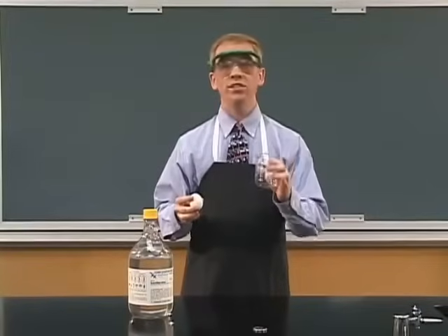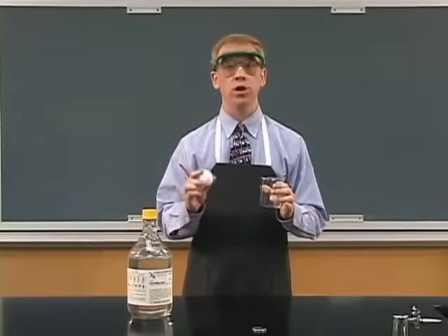Now, I'm going to show you the right way to identify a substance according to its smell. It's called wafting. Simply fan a small amount of the vapor in front of your nose to identify its smell. Now, it's a lot better than that. Let's waft.